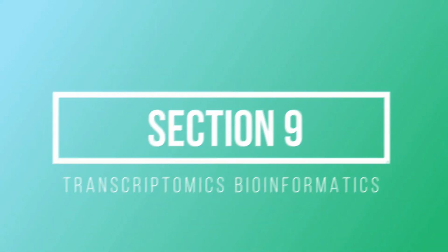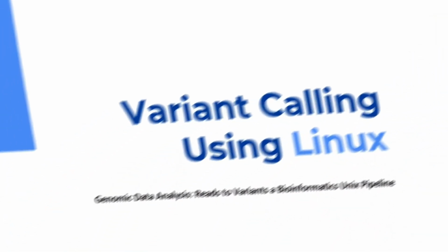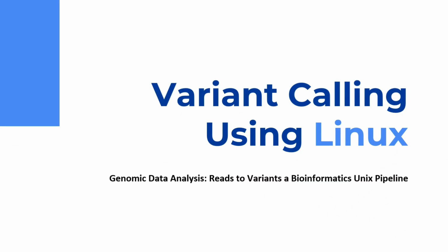Hi there. Welcome to the variant calling course using the Linux operating system. In this course, we will be dealing with the bioinformatics pipeline for analyzing genomics data, where we will get the reads file from SRA form or FASTQ form into a variants file.